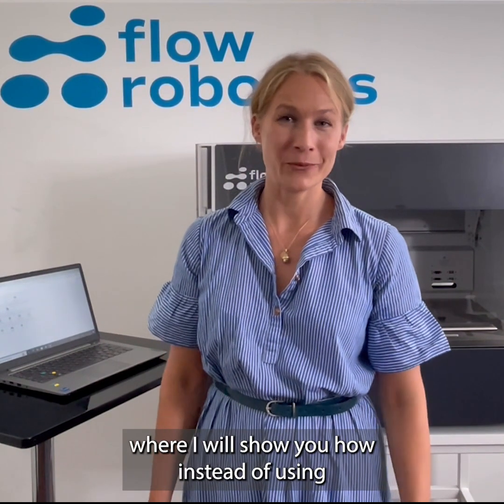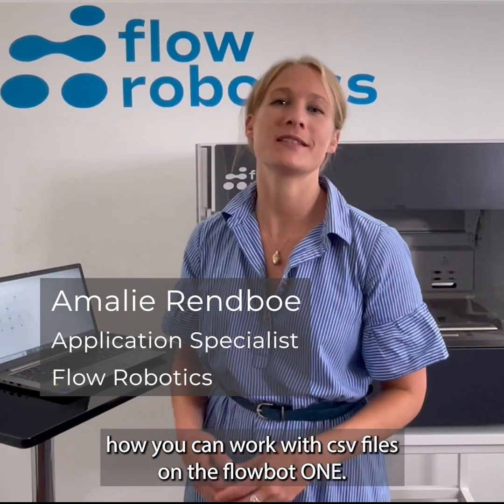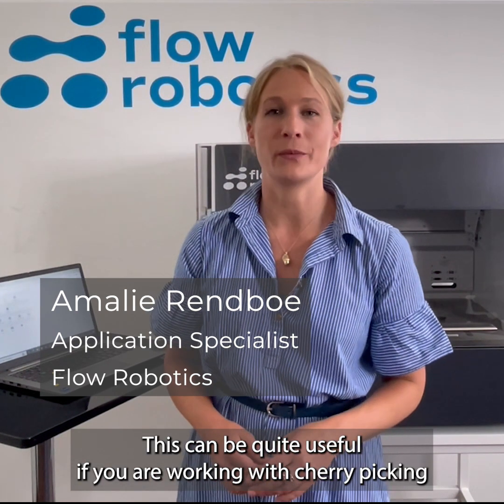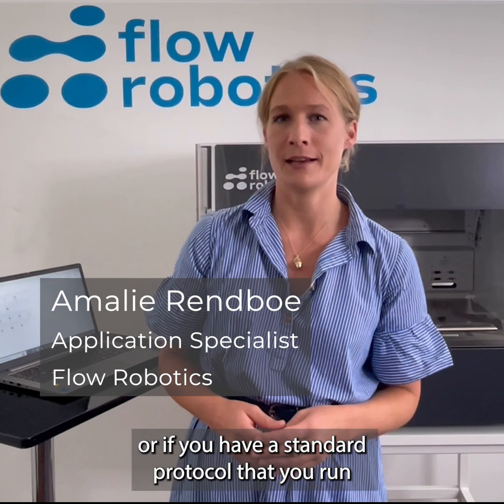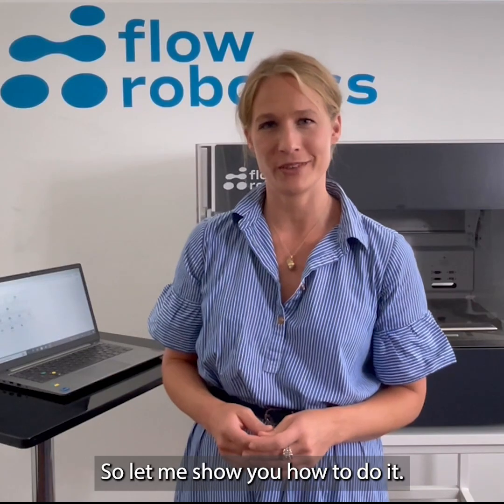Welcome to this video where I will show you how, instead of using the user-friendly software available, you can work with CSV files on the flowbot one. This can be quite useful if you are working with cherry picking or if you have a standard protocol that you run but you have varying amounts of samples. So let me show you how to do it.